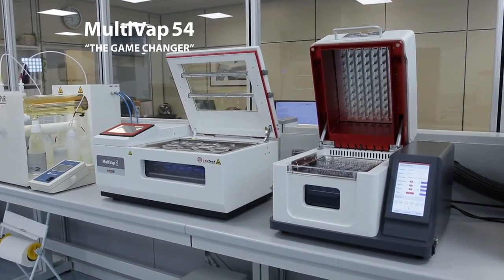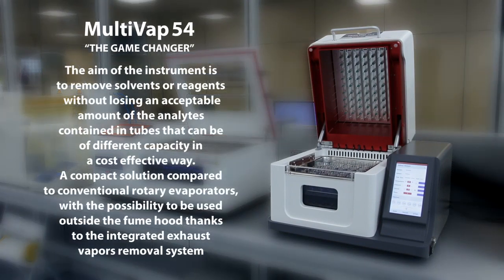Take for example the Multivap 54. The aim of the instrument is to remove solvents or reagents without losing an acceptable amount of the analytes contained in tubes that can be of different capacity, in a cost-effective way.